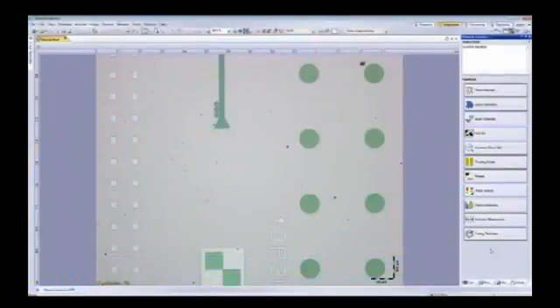Some of the features in the software, we have material solutions in the Stream software. These solutions are packaged and individualized for certain custom uses in the field. For industrial applications, we have grain analysis for metals and cross sections where they want to measure grain boundaries and grain patterns and widths. We have layer thickness measurements for cross sections of materials where they have layers that they want to measure. We have metal inclusions. Certain manufacturers of different types of metals want to measure their inclusions. So all of these porosity measurements, all of these solution modules are designed specifically for an application.